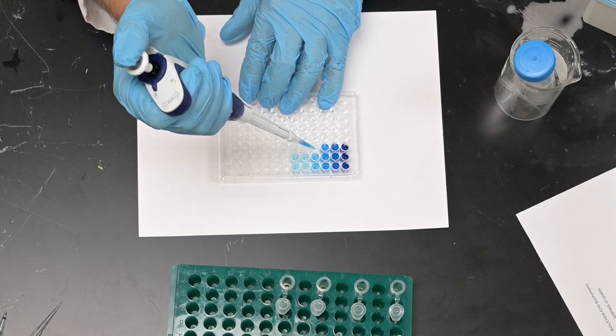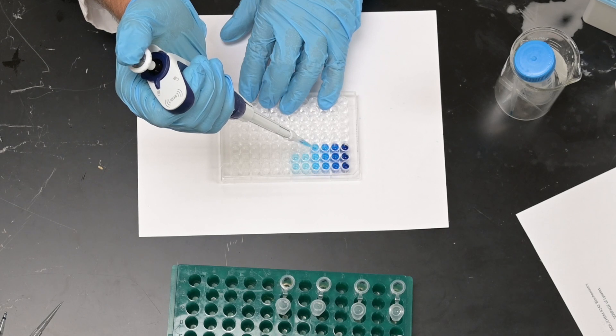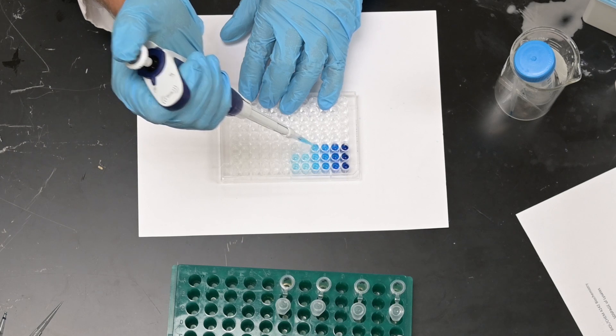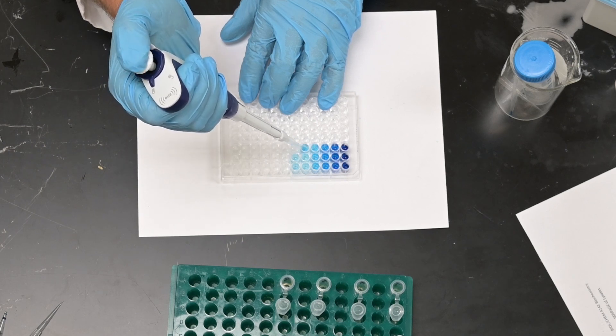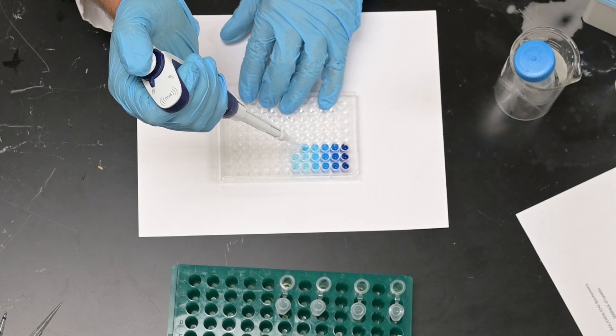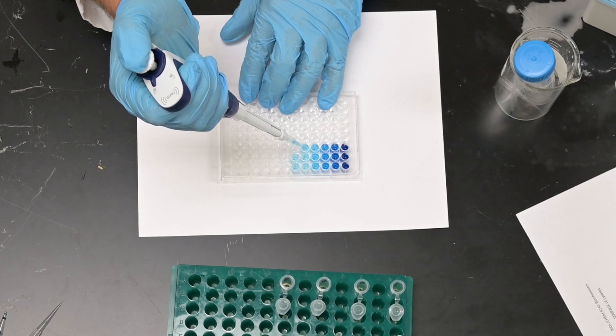So there's no need to change tips out for each one of these samples. In fact, if you change your tips, your standard curve will probably not be quite as good. So I'm doing the last sample, the 1/16th concentration.